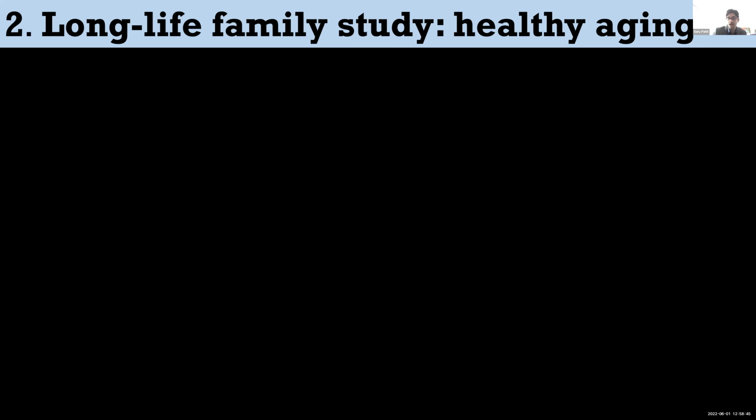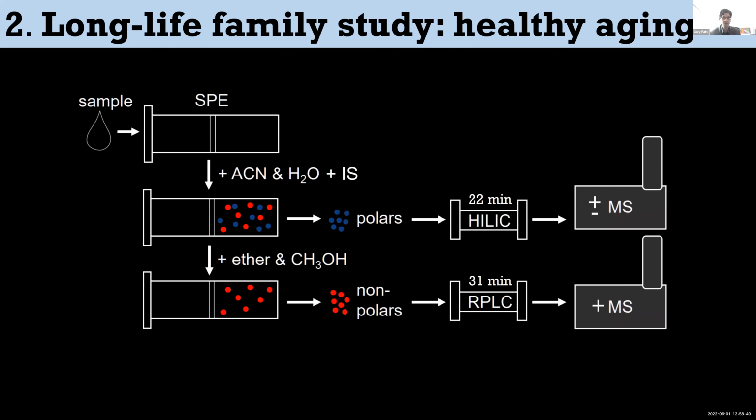So how do we carry out these experiments? As I say, it's 15,000 different samples, and I should point out that we're analyzing blood. The way that we're doing this is we're using 96 well plates, these are Captiva Agilent plates with solid phase extraction. And we're using acetonitrile and water to capture the polars. We're adding internal standards to those. We're using C13, N15 labeled amino acids.